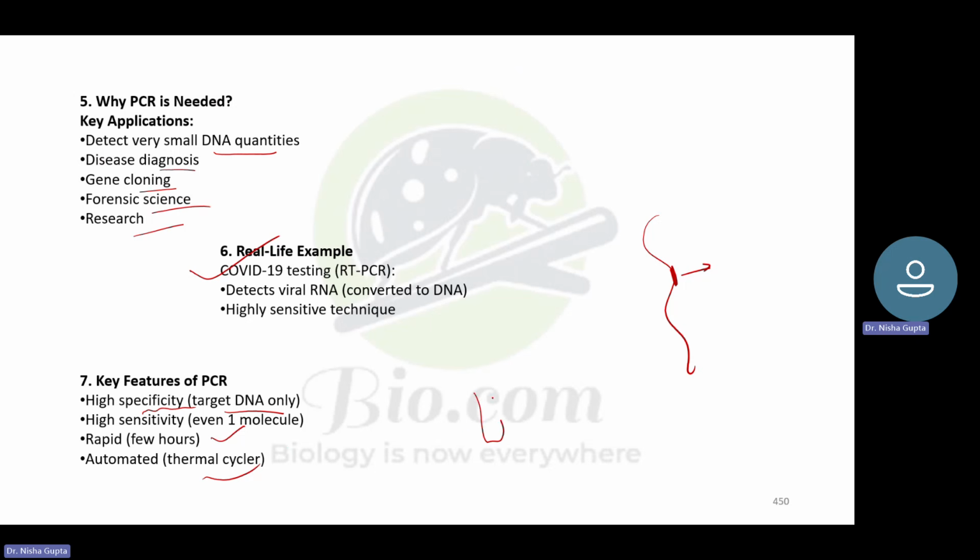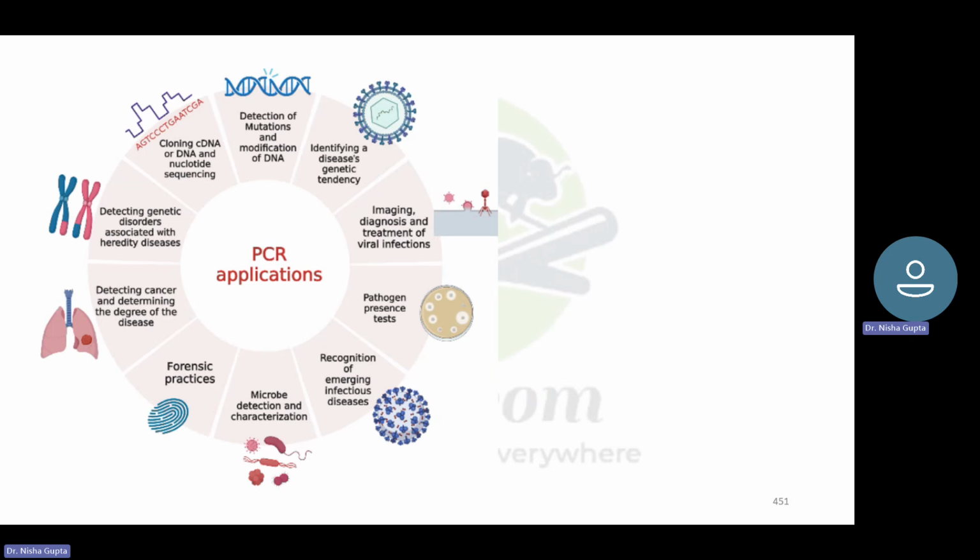Like आप जो reaction mixture prepare कर रहे हो, now we are having fully automated system. So those are of course expensive, लेकिन जो preparation reaction tube का है उसके बाद आपको manually कुछ नहीं करना है. Everything will be done by the instrument. So these are the applications of the PCR.